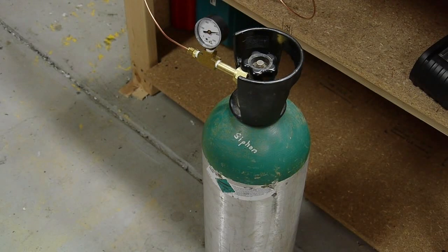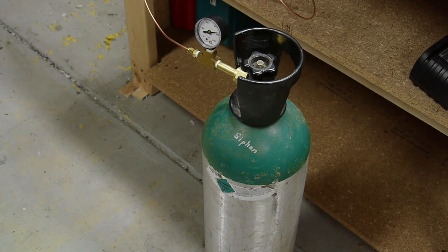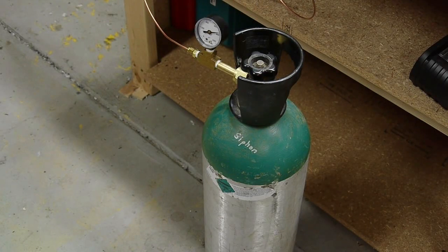Here we have a 20-pound CO2 cylinder, and it says siphon on there, which means that inside the tank there's a tube that goes all the way to the bottom. So when I open the valve, I get liquid CO2 out the output as opposed to just gas.